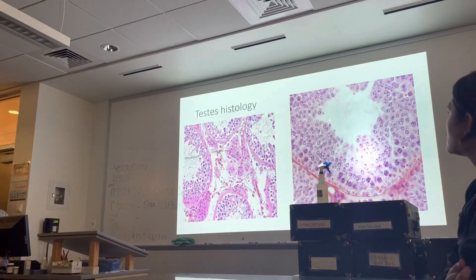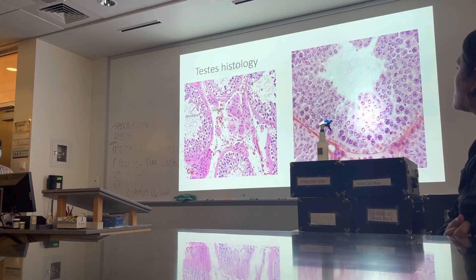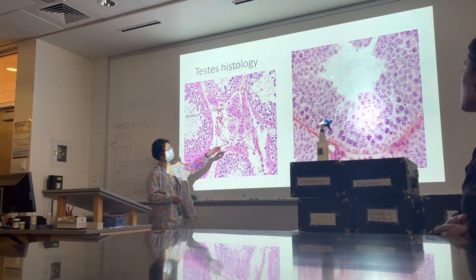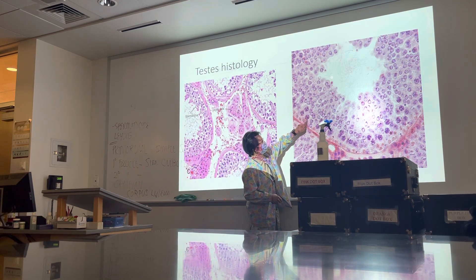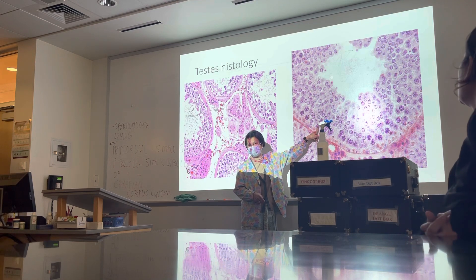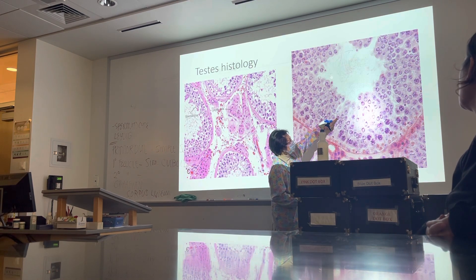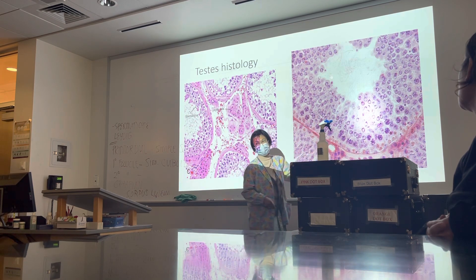Be sure you know which one is the tubule. Most of the cells there that you see are the spermatocyte. You can identify some cells that are dividing — very prominent chromosomes. That's a spermatocyte; it's undergoing meiosis. There are Sertoli cells here, but it's really very difficult to identify the Sertoli cells.